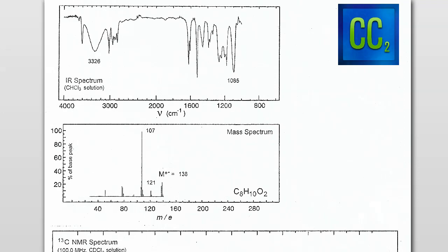Okay, so here we are, and this is the final part of the unknown spectroscopy course. A while ago, actually several years ago, I posted a video like this on YouTube, and it was one of the most popular videos, which is what spawned my idea to do the whole course. I will link that video in the playlist at the end of this, so in case you haven't seen that original one, you can revisit it for additional practice. I will try to release some of these throughout the fall as we continue, but this is going to be the capstone for the current course right now.